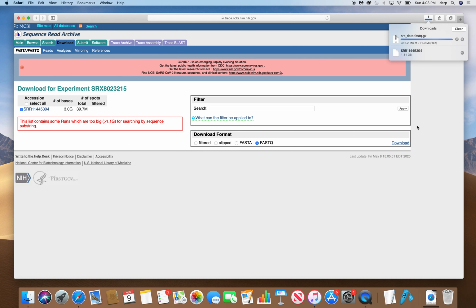So let's say if we wanted to evaluate 2 different mapping tools, and that's all we were doing, which is pretty simple, you would start with 5 terabytes of data. Each tool would add roughly about that much file space to your machine, and you would wind up with 15 terabytes of space used up. So we are going to try to minimize that as much as possible.